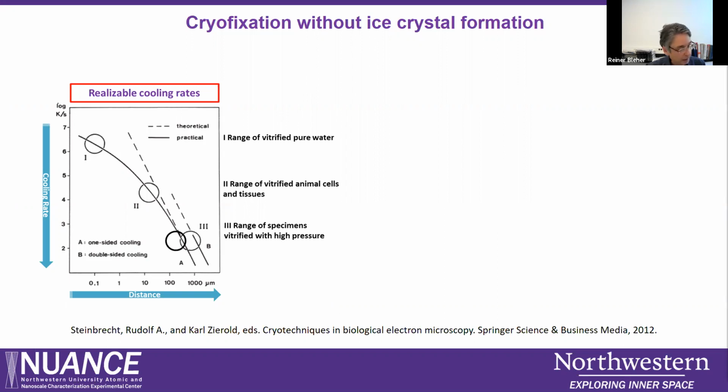And we can only influence this last parameter, which is the heat flow. Now, calculations show that the highest possible freezing rate drops drastically with increasing distance from the cooled surface. At a depth of 0.1 micrometers, a cooling rate of 10 to the 7th degrees per second may be attained, as we can see here.